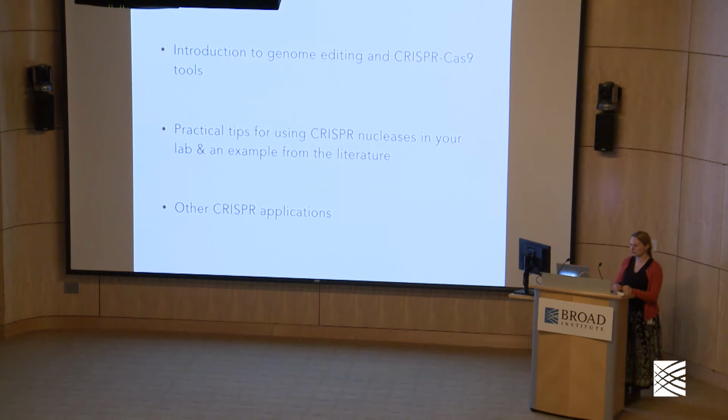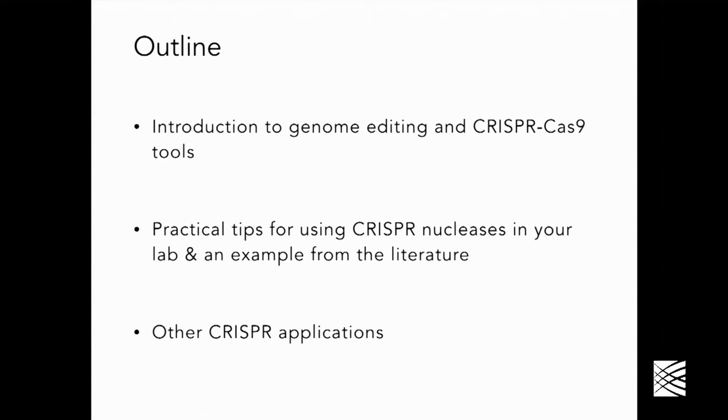So here is an outline of what I plan on discussing today. First, I'll give a brief introduction to genome editing and CRISPR-Cas9 tools. Secondly, I'd like to provide some practical tips for using CRISPR nucleases in your lab, and then show an example of these tips from the literature. Lastly, CRISPR-Cas9 has a suite of very useful tools, and I'd like to highlight some of those in the third part of the talk and go through some of these applications that may be of interest to you and to your lab.